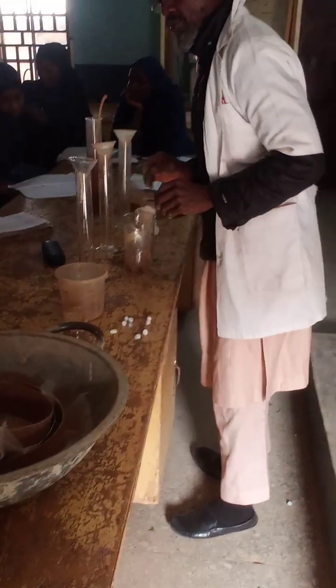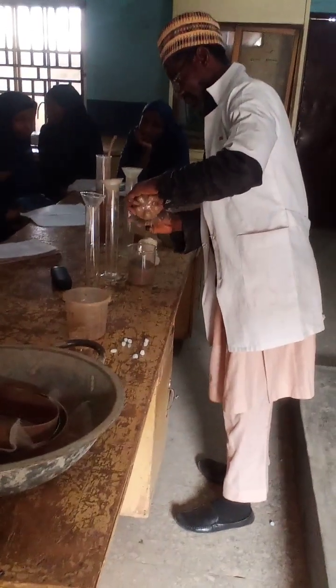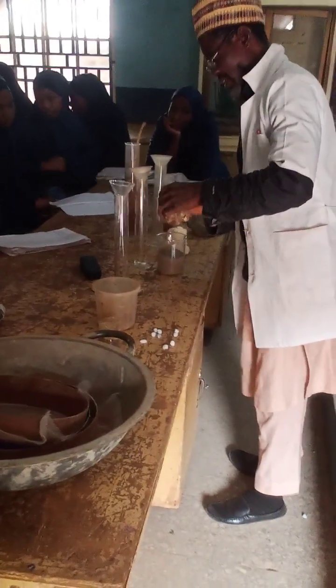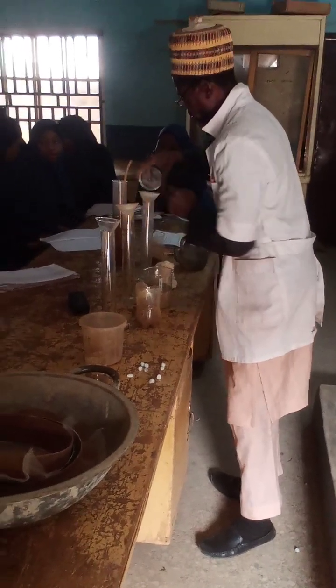So what we'll do, we take equal samples of soil. This will be taken equal sample as thus.